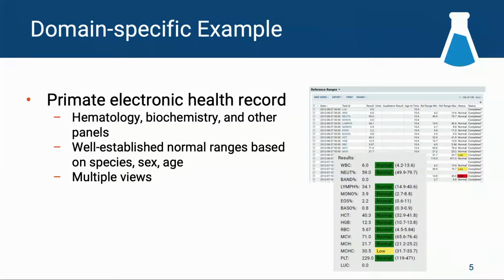And so the clinicians, the vets and the vet techs that are providing the animal care can very quickly look at this because we've wired up the knowledge that here's what it's supposed to be. Anything out of that range is something to potentially investigate.